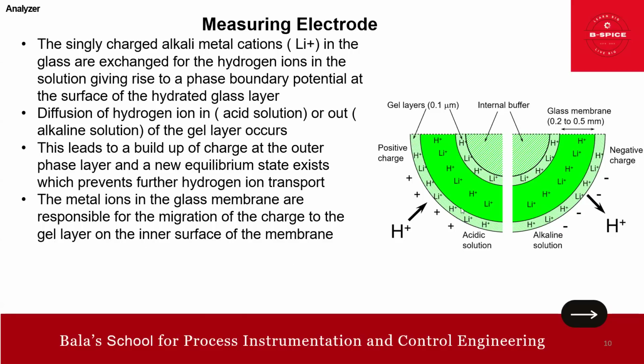You can see here, this is the gel layer, the inner surface of the membrane.